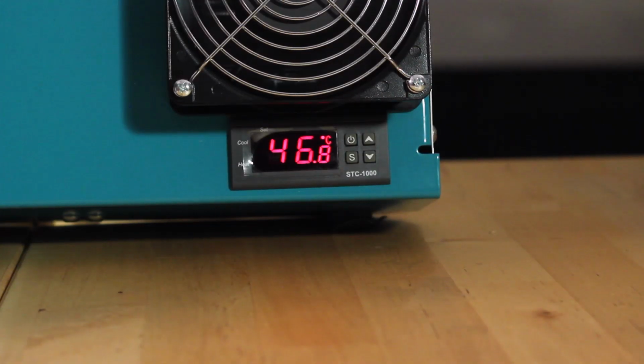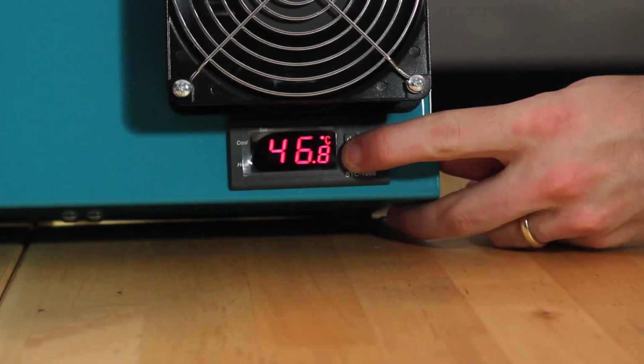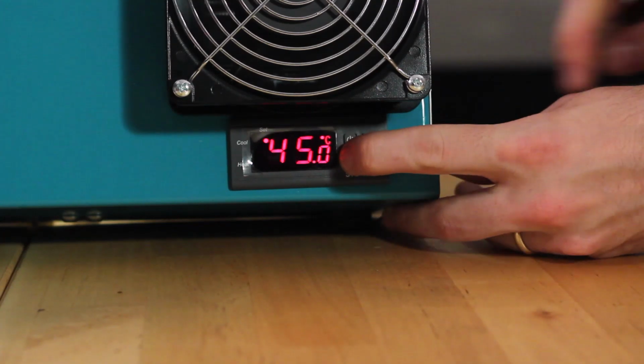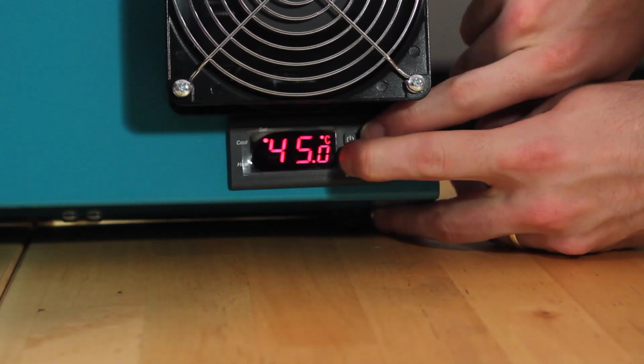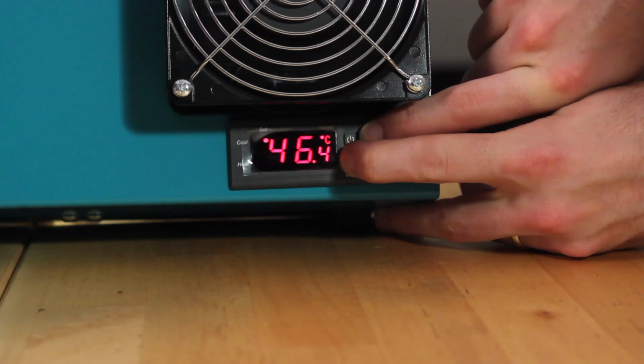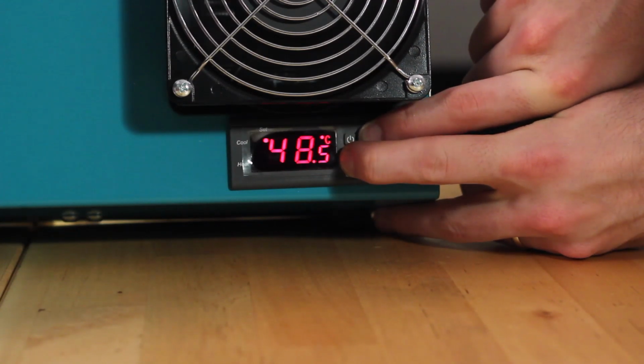To set the temperature on our SuperC extractor, we'll want to access the temp controller at the back below the fan. Press and hold S until F1 appears, release S, then repress and continue to hold it. While holding S, we can steer the temperature up or down using the arrow keys. We're going to raise our temperature to 53 for this hop extraction.